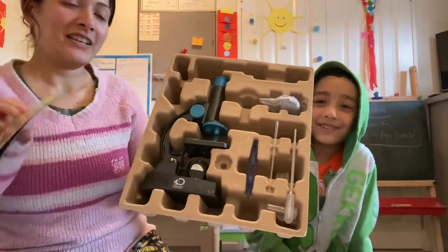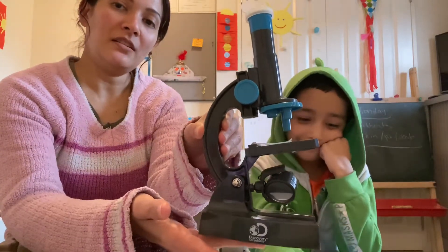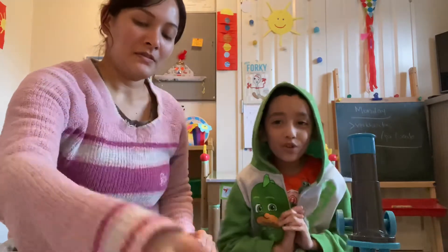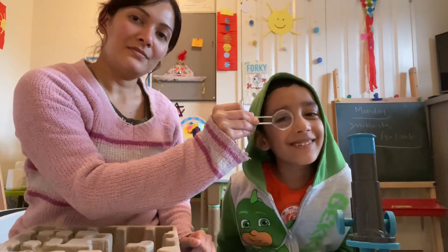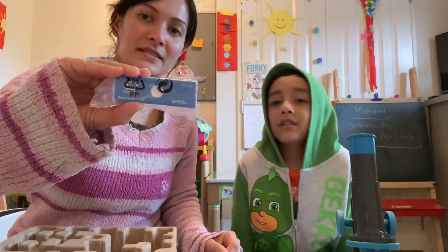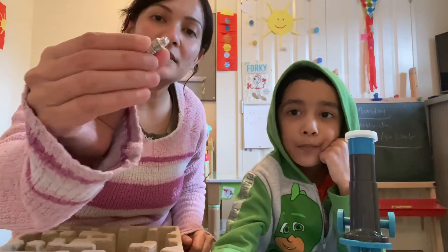It comes with instructions. Let's check out what things we have in here. So it comes with a microscope that requires two AA batteries, which go down here. It also comes with a pair of tweezers, a stirring rod, a pipette, and a magnifying glass. There are two vials, some prepared slides, slide covers, labels, and a spare bulb.